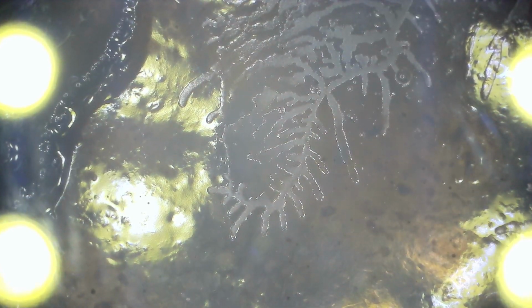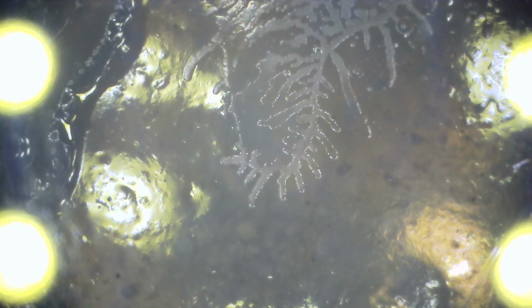Look at that, fanning out into these fern-like fingers. I wonder what informs the structure that is growing here. Oh, there's a lot of backlash in this focus mechanism, sorry. Oh, that looks so sweet. So I would estimate that these fingers that we can see there are on the order of maybe 0.5 millimeters thick, wide. So they're very small. I would zoom down even further, but I'm limited by how close I can get to the sample without taking off the lid of the Petri dish, which I don't want to do.